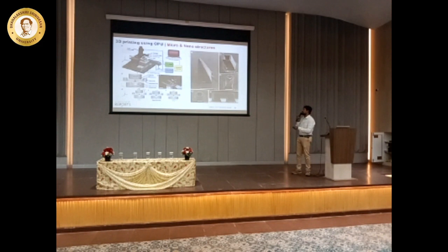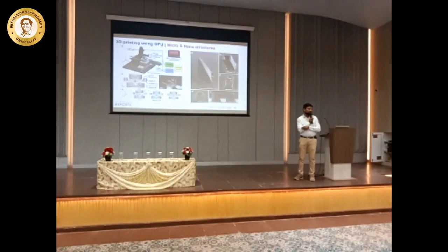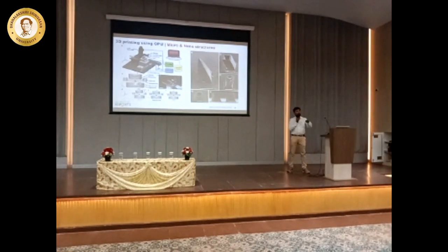And another one is, you think it's 3D printing? It's 3D printing, but the structures are in microns. This is created using an optical pickup unit. This is fantastic, no? One CD drive can give you all these things. It's not that easy. If you say stereolithography, the SLA technique, they use a UV laser to fuse or make structures, and this Blu-ray player has a blue laser. So this Blu-ray laser can create a structure.